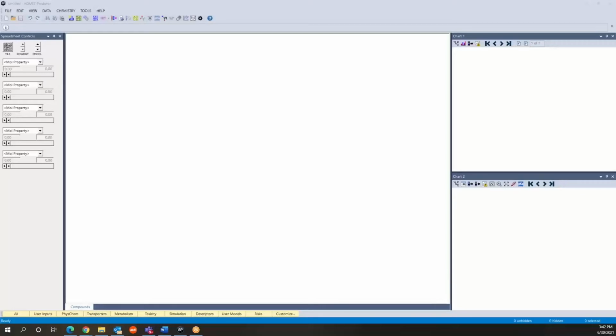Thank you for joining me in this ADMET Predictor interactive tutorial dedicated to MedChem Designer. So the topics for today are to work with MedChem Designer, to edit structures, and also to create and save new structures. We will also see how to calculate ADMET properties within MedChem Designer.